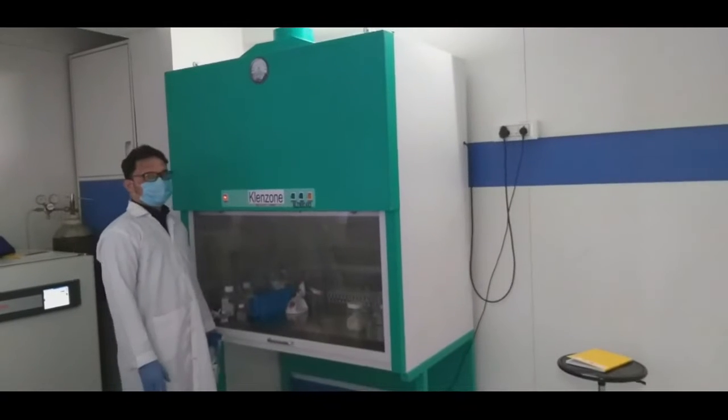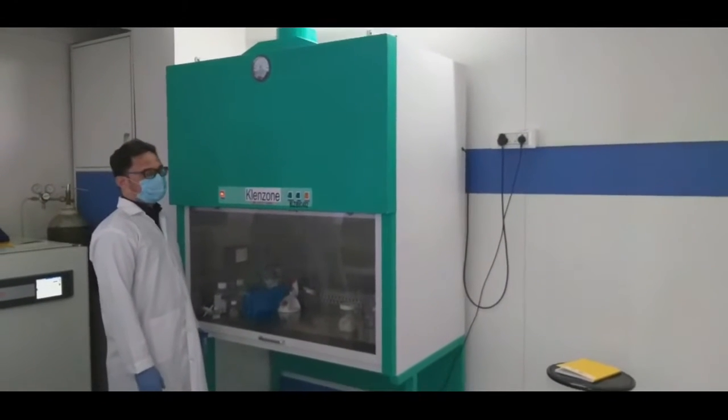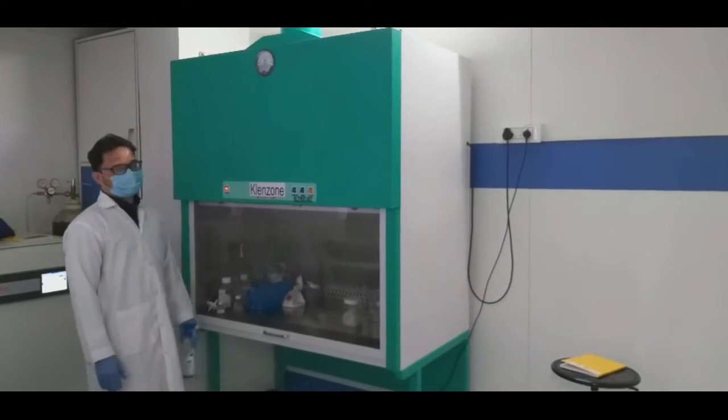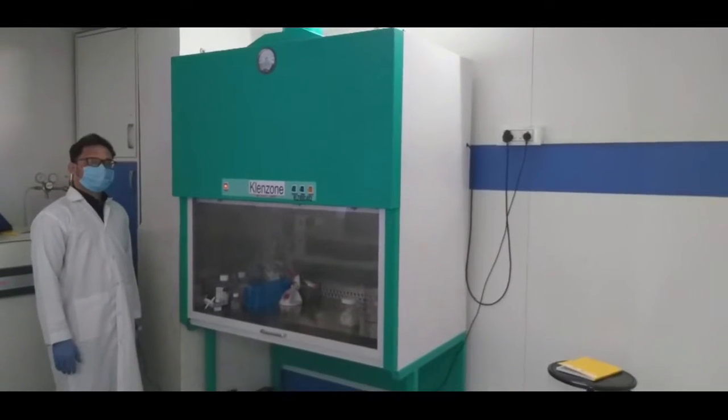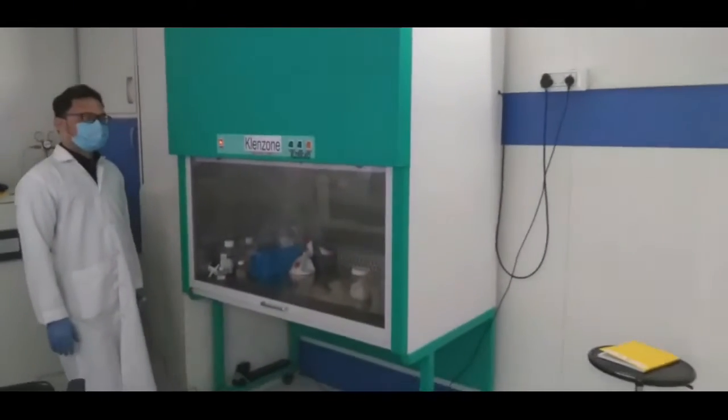Before starting the actual animal tissue culture work, we need to understand the very important instrument required to carry out this work. The name of the instrument is the Biosafety Cabinet.